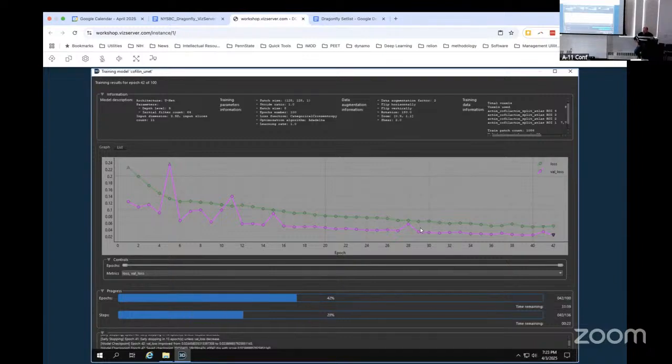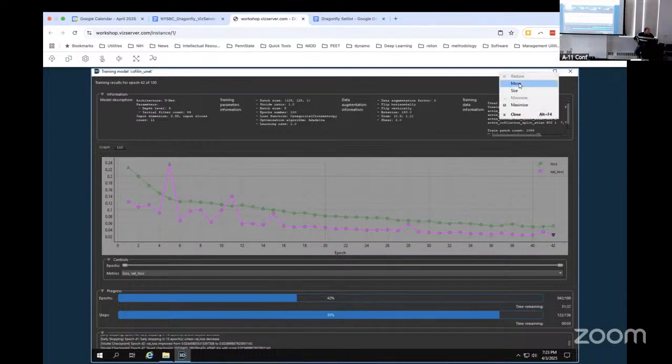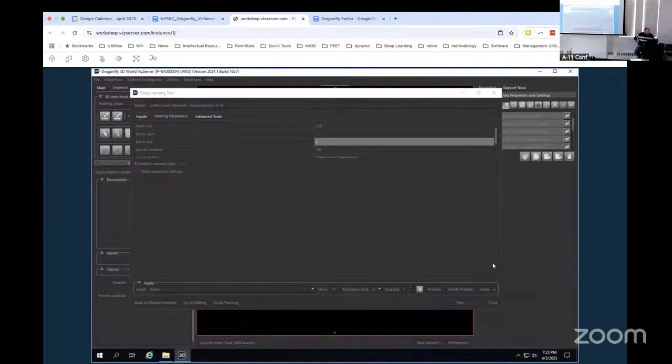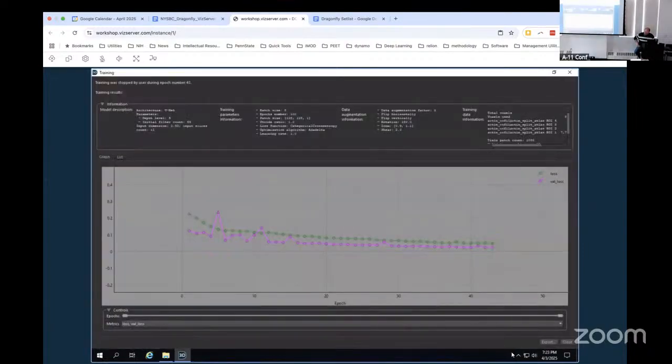This network could train for a while if you wanted it to, and it'll just get a little bit better. Unfortunately, it's not truly asymptotic yet, but we're only going to get so much more out of this, and we only have so much time. So let's try to segment the whole tube. Stop this from training. We'll wait for it to show. All right.